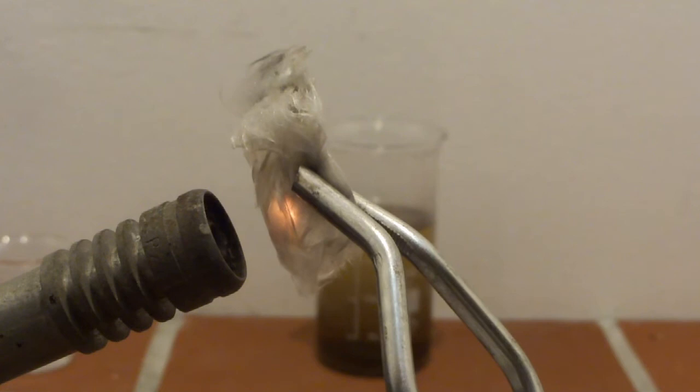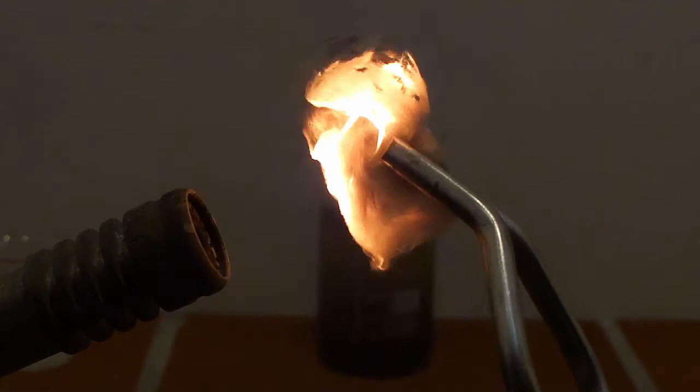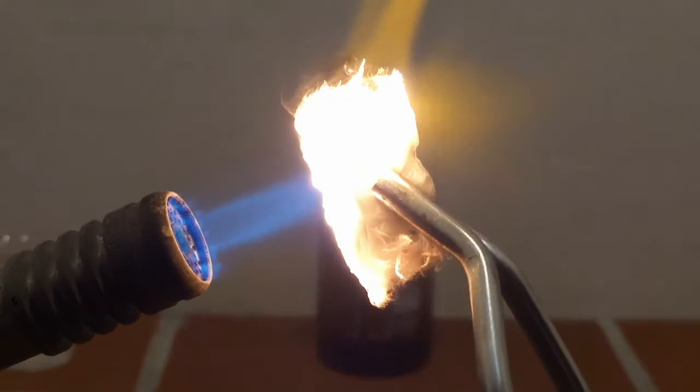This solution is then applied to a piece of quartz wool, which is then set on fire and heated with a Bunsen burner. From the heat, the chloroplatinic acid decomposes to chlorides and then to platinum oxides, which are then reduced by the carbon in the ethanol. The contact prepared in this way has a very high platinum content and is too reactive for an Ostwald reactor.